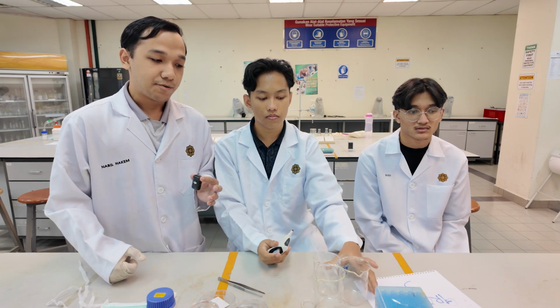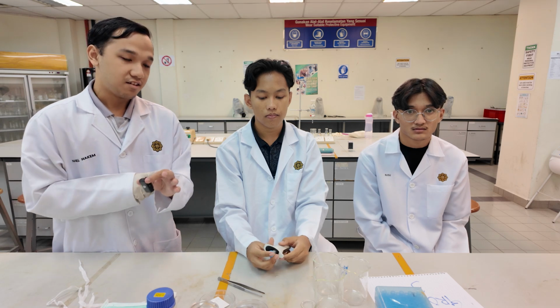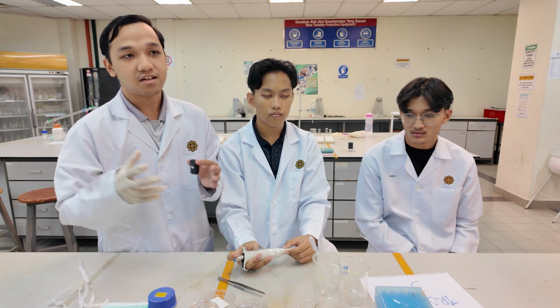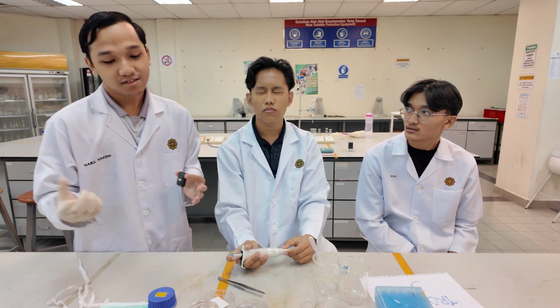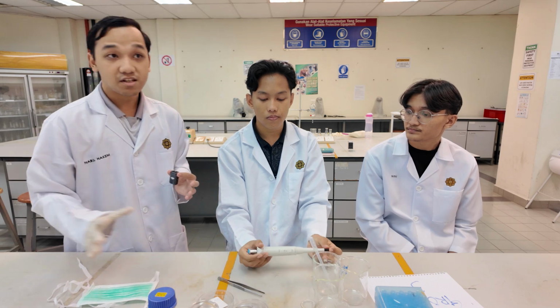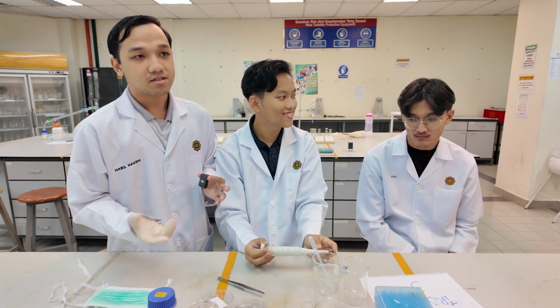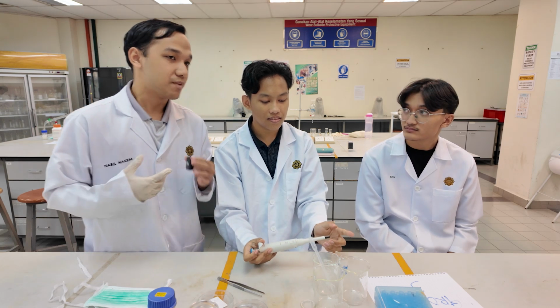Because we don't want to get some skin contact that can increase the cancer risk also. And if we come into contact with the UV light, our eyes can burn, like a corneal burn. But the long wave, even though it's safer than short wave, can still give some risk. It may cause some irritation and retinal burns also. Now I will pass to my friend.